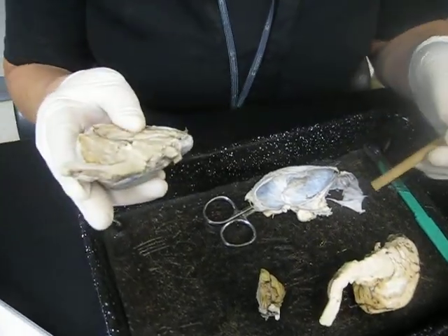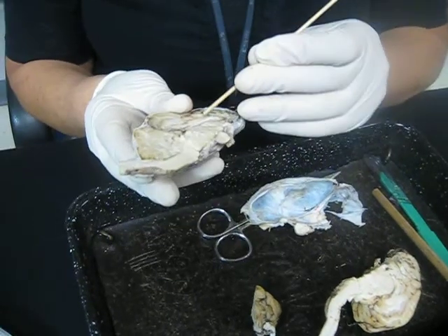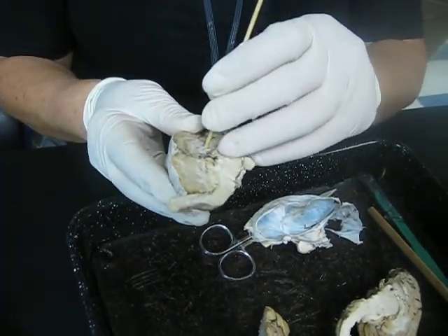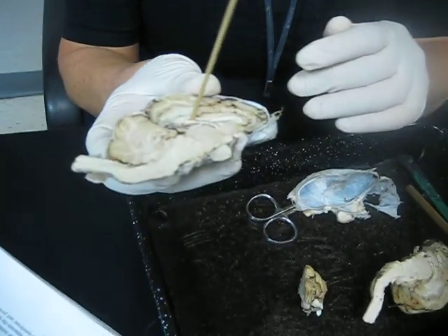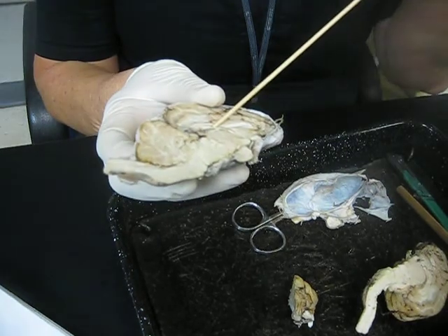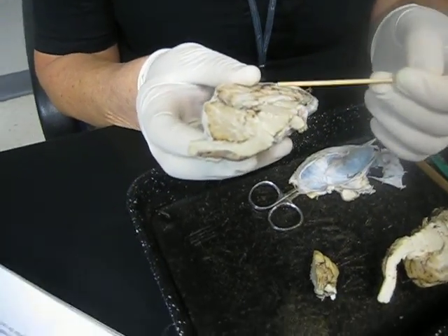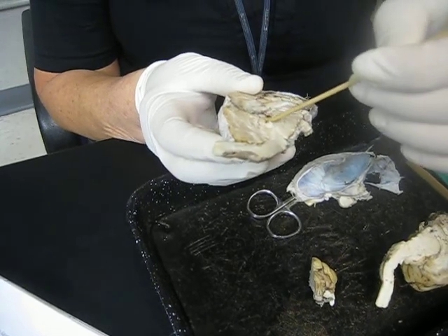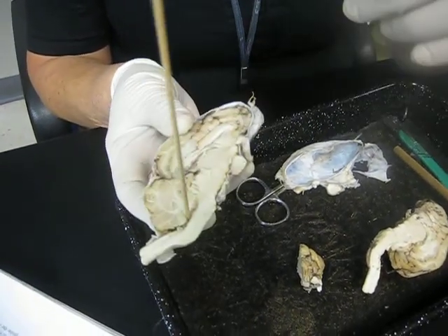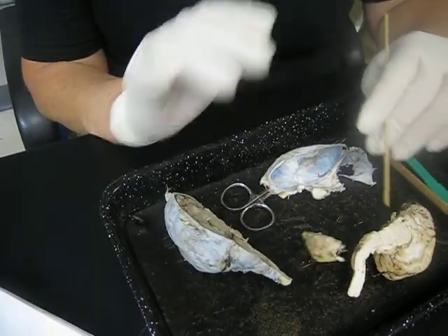Do you have a stick? Can I have that stick right there? That's good. And right below the corpus callosum, you put your stick in there, and that's the lateral ventricle. Sorry, lateral. So you have 2 lateral ventricles. It's connected to the 3rd ventricle. The 3rd ventricle is connected via the cerebral aqueduct to the 4th ventricle. Okay? Any questions? Did I forget anything?